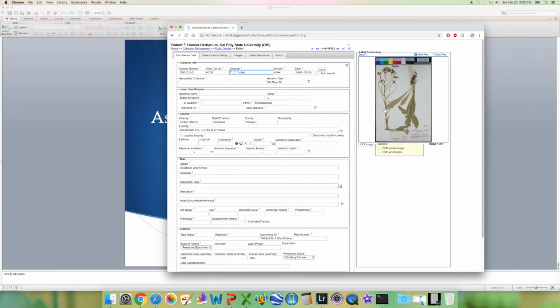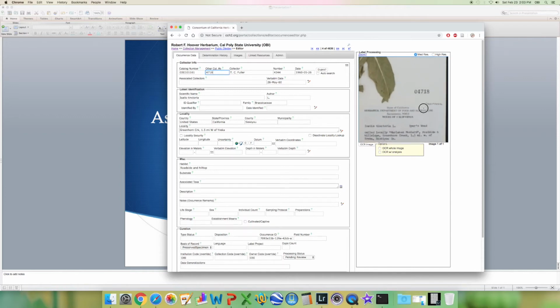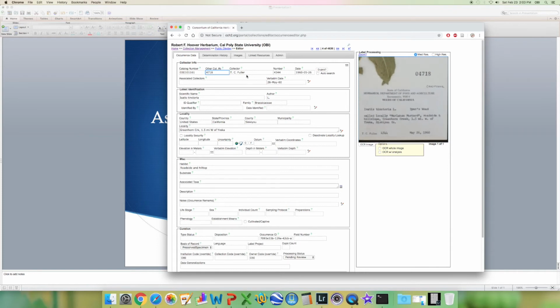If no duplicate is found, you'll want to double check that the accession number that you entered is the number that shows up on the specimen record. You may have to delete or add leading zeros. Another possibility is that the person who first entered this accession number entered a typo. If this is the case, then you'll need to try to enter the collector number, and the date, and then click this dupes button. If a duplicate or a record that perhaps is the same as that record exists, then it will show up in another window, and you will be able to link those or merge the records as appropriate.